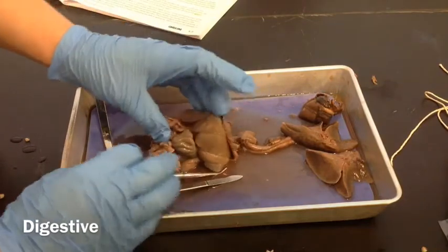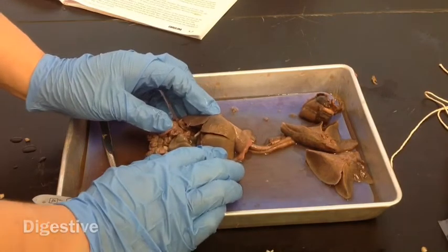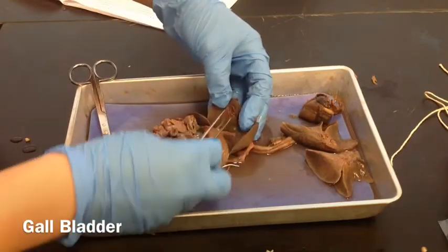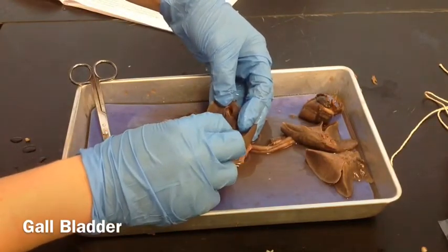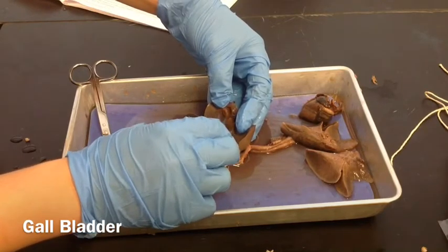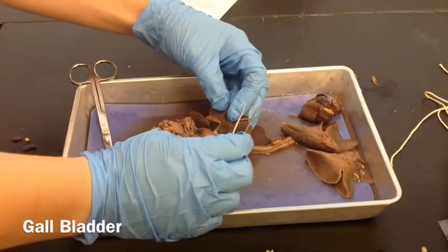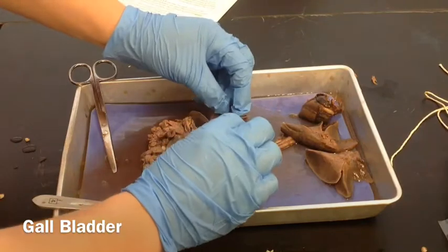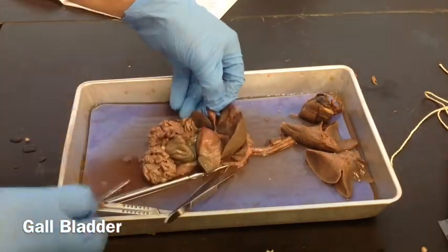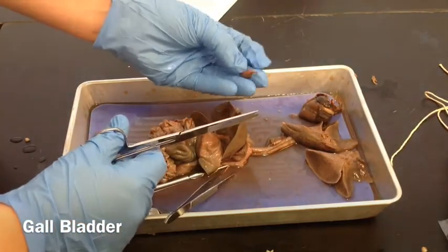We're going to go through the steps. I'm going to show you how to remove the different parts of the digestive system. It tells you to go ahead and detach the gallbladder, so you want to just kind of gently pull that out. Be careful not to puncture it, not to tear it. This is the one that makes bile — you can cut it like that, and then you can measure it, weigh it, all the things it tells you to do. So that's the gallbladder.